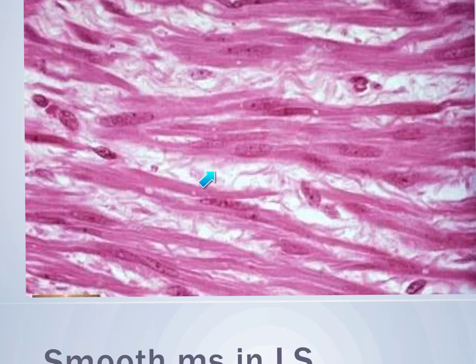This is the soft or fine connective tissue in between the muscle fiber groups, and of course containing blood vessels. And if you look at the muscle fiber itself, as we said, it is spindle in shape with acidophilic cytoplasm, and the nucleus is of the active type mostly. They have a pale nucleus with oval shape, and they are single and central in position.